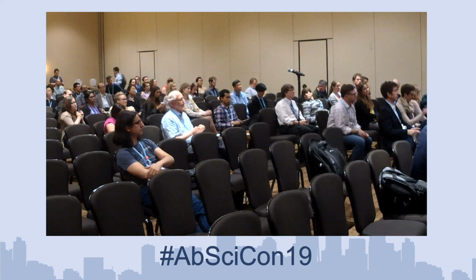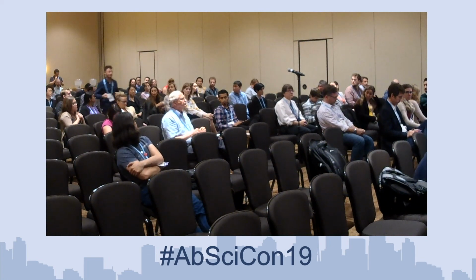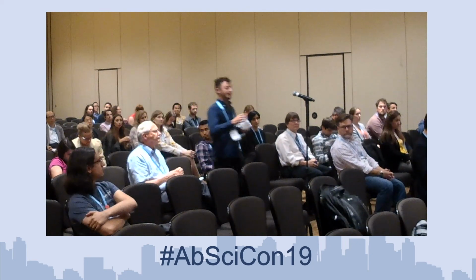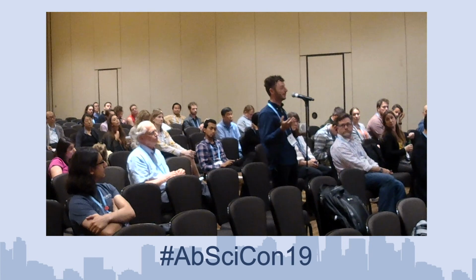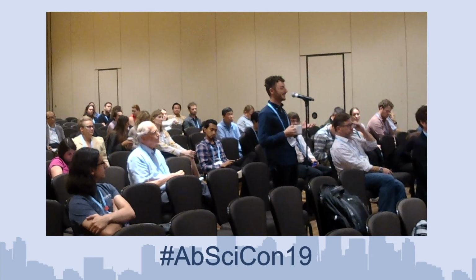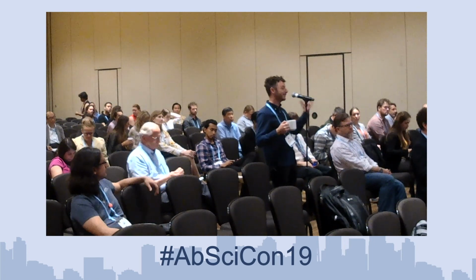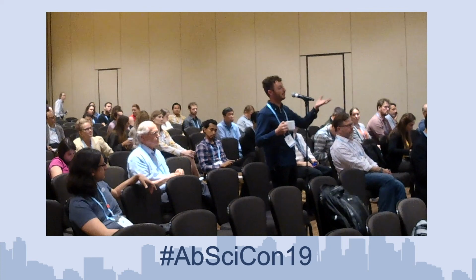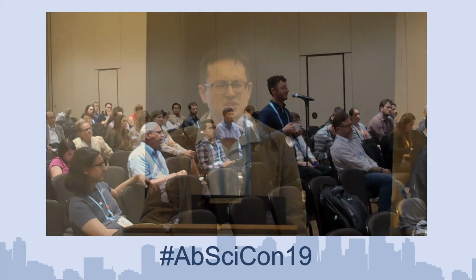Any questions for Chris? Yeah, come use the mic quickly. So the column on the silicone chip is really cool. It's very innovative and neat. But even looking at low masses, one of the big things that makes a GC heavy and big is the oven part, right? And you need it for bakeouts to make sure you keep your column clean. So what's the high temperature you can get to with the chip column? The high temperature, I think, is around 350 degrees Celsius. Cool, that's great.